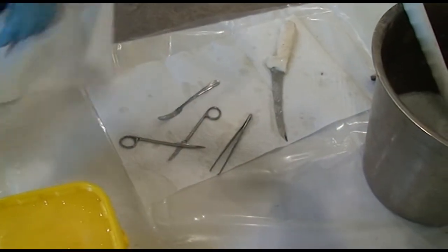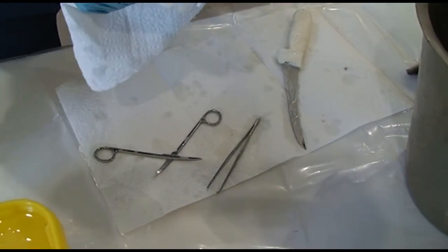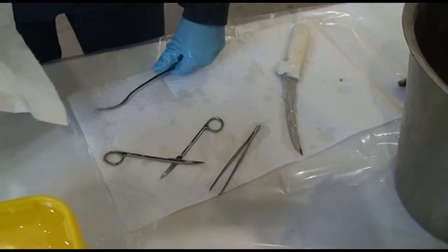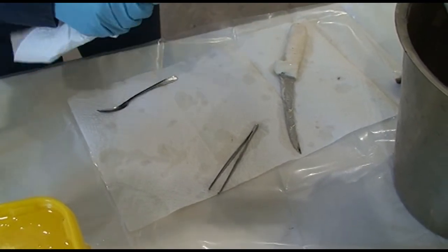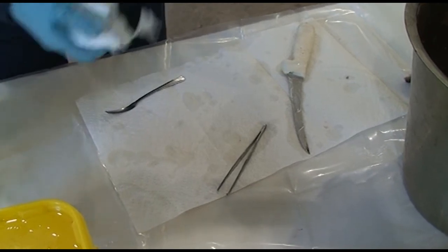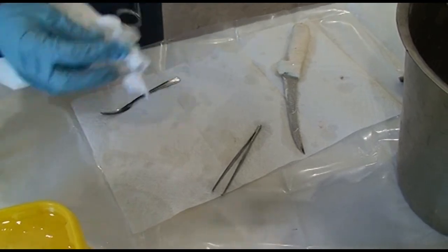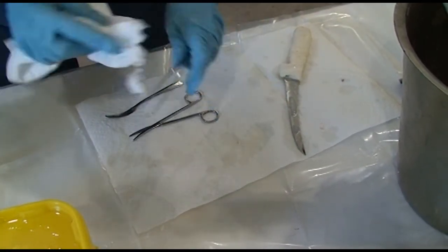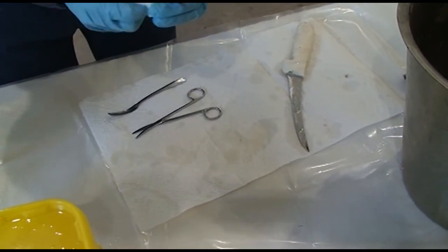Once we have those cleaned up, then we just want to take paper towel and make sure we dry them off good before we put them away. Usually let them sit out to air dry just a little bit, even once we dry them off. So bleach, Virkon, really any disinfectant will work that way. And then wash your coveralls and change gloves before you go on to your next sampling.